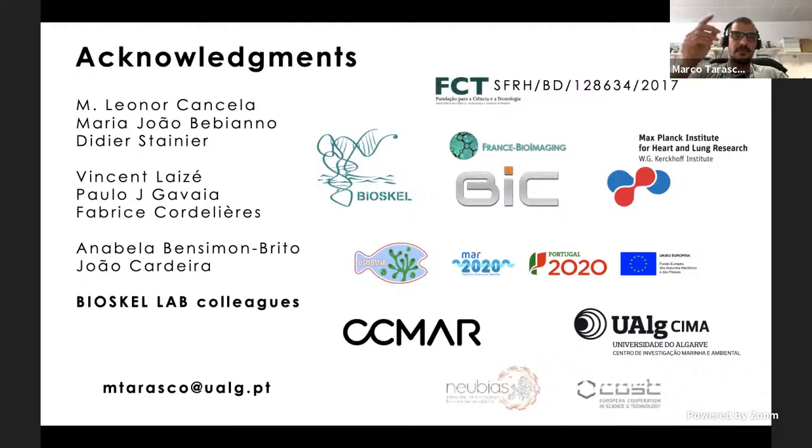Yeah, so already from Fiji, before starting an analysis or a workflow you want to do, you start the recorder. It will record all your steps. And then from that you already have a macro that of course will need to be adapted to work with the different images and so on. But already for some simple steps, it's useful. Then on the Fiji website, you have a page where all the functions are described and what they do. So then of course you need to spend a lot of time, a lot of nights writing, testing.